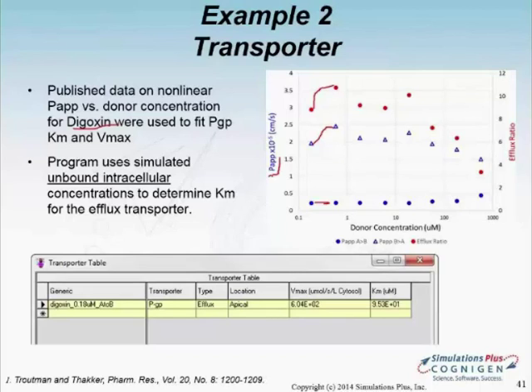Thank you, Viera. Question: when apical pH is changed, let's say the range is from pH 5 to 7.4, is transporter affinity, for example Km and Vmax, also adjusted? No, not at the moment. We have seen some reports, and we know that some transporters show different activity at different pHs.